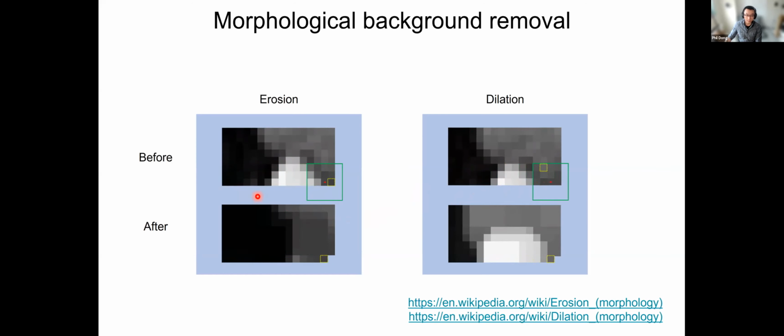Okay, so with that, we are done with pre-processing. We'll have a movie that's kind of clean of noise and background. The next thing we want to do is motion correction on it. And the way we do motion correction is quite similar to our pipelines. You probably heard this in the morning already.